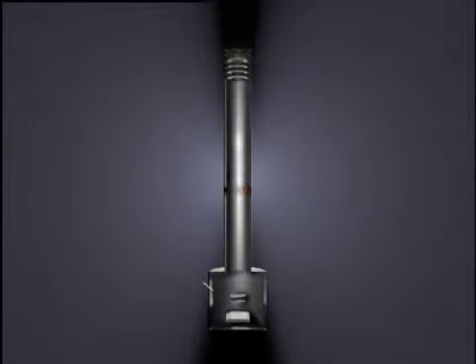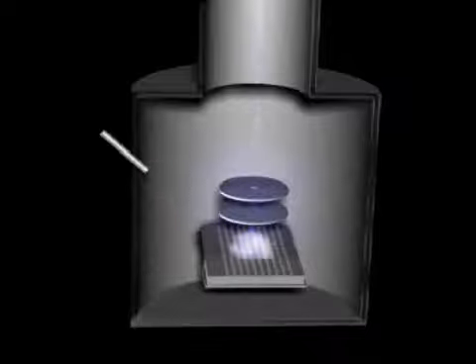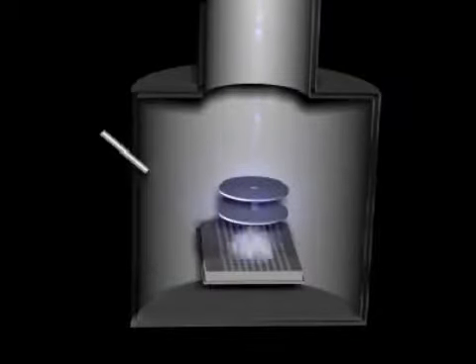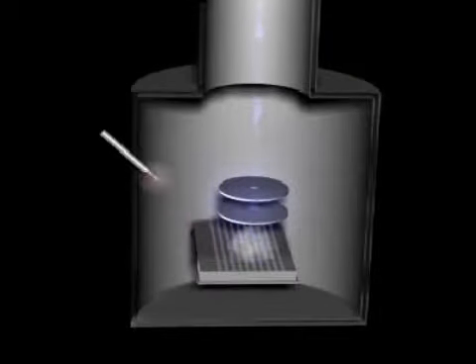The MALDI-TOF process is a two-phase procedure. Initially, the samples are fixed in a crystalline matrix.